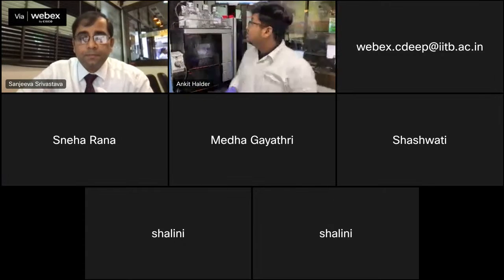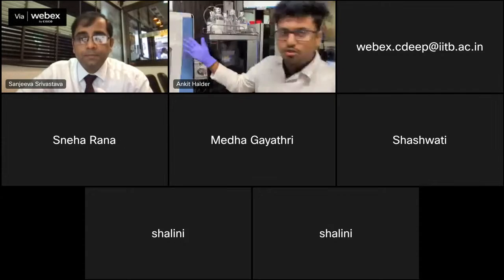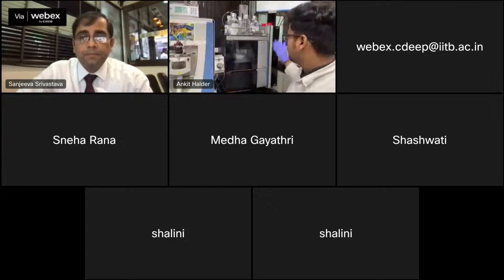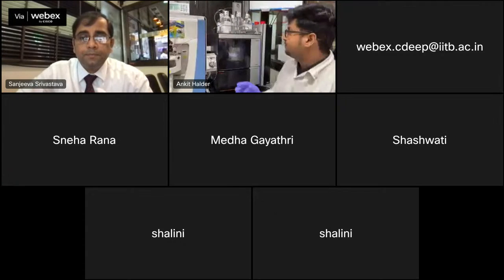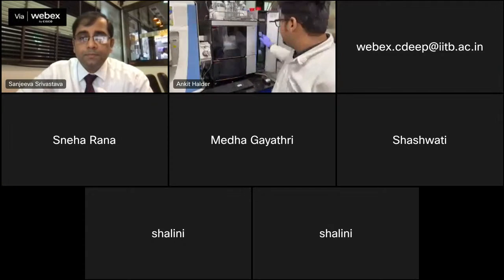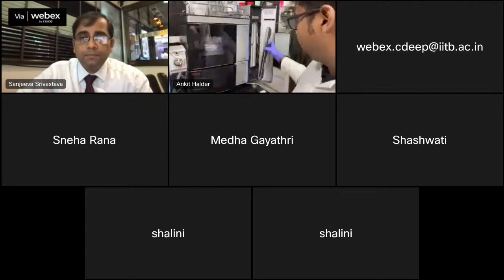Okay. So this is the Q-Exactive instrument. The Q-Exactive is a hybrid instrument which has been connected with the Vanquish UHPLC. So let me first give you an idea how this UHPLC and the Q-Exactive actually work.